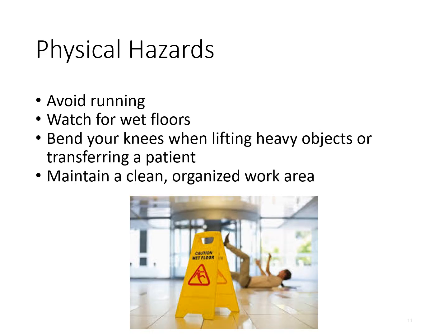So physical hazards, most of these are going to be common sense. Avoid running in the work area, watch for wet floors, make sure you bend your knees when you're lifting heavy objects or transferring a patient. Make sure you familiarize yourself with proper lifting techniques that can be found in your textbook. And then maintain a clean, organized work area.